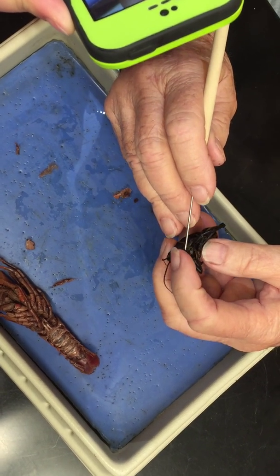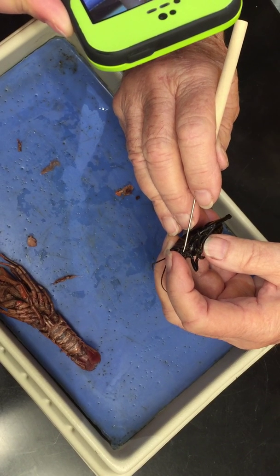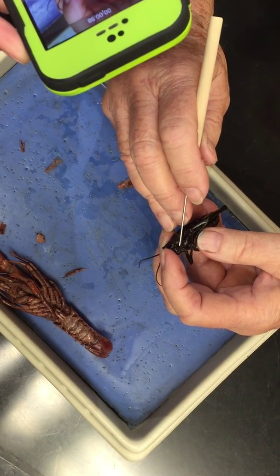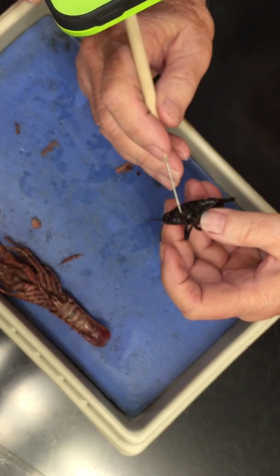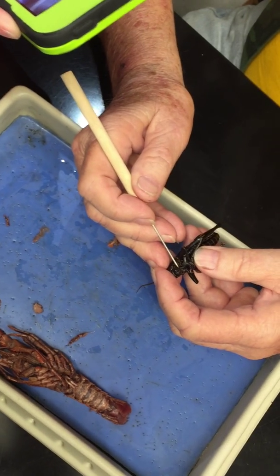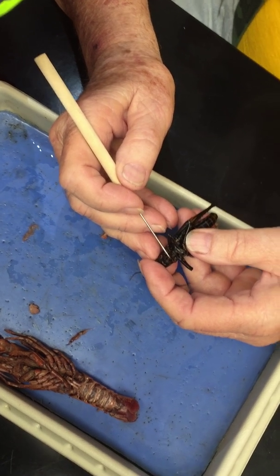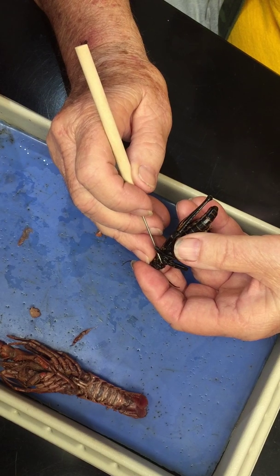Now, there's a galea and lacinia on the maxilla. Lacinia was what? The toothy thing. And the other one, the galea, is the spoon-shaped thing. Now, the bottom here, notice there's a labial palp on the labium. The labium is the bottom part. And if I look inside, there's a little light-colored lump. That's a hypopharynx.